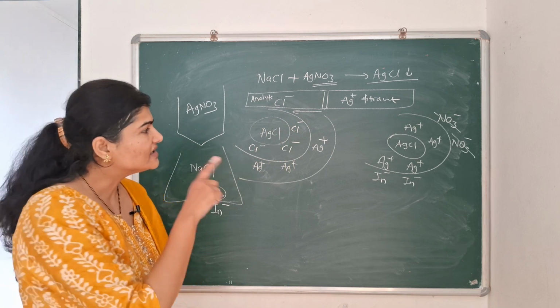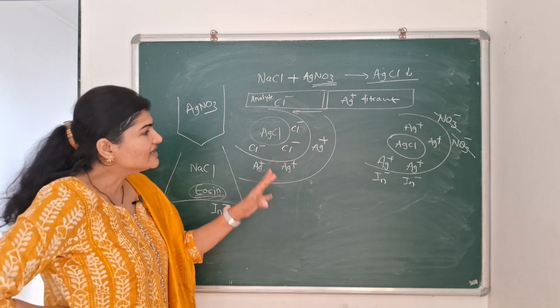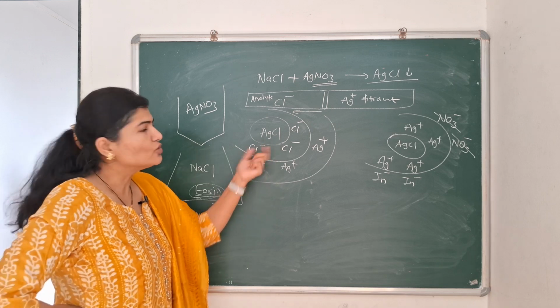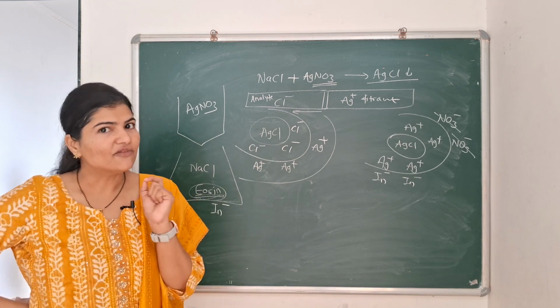They give the precipitate the pink color, and that pink color indicates the completion of the reaction. So here we are taking into consideration the property of a colloidal precipitate to adsorb its own ions which are in excess. Now here we have to consider a few points.